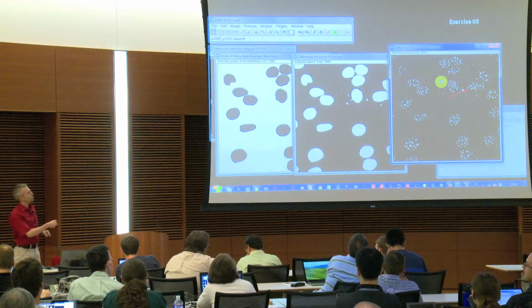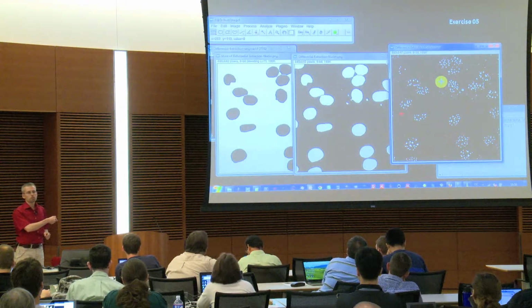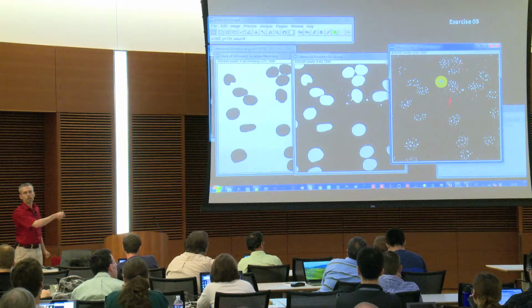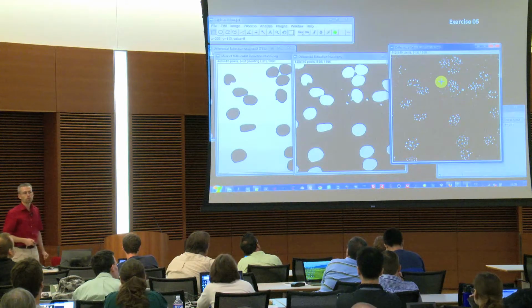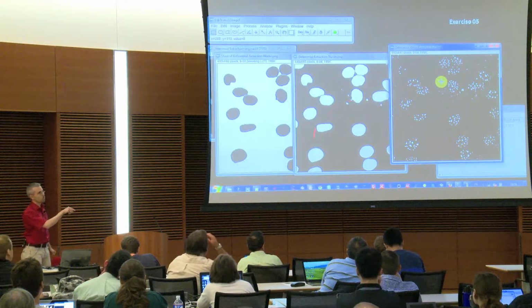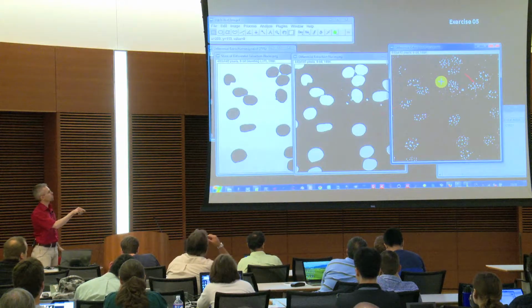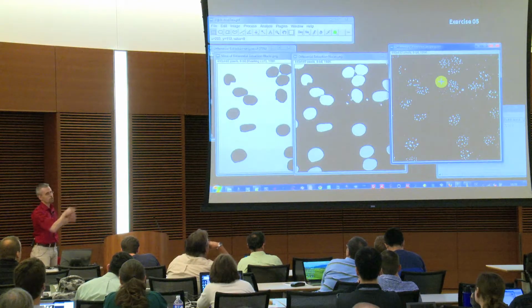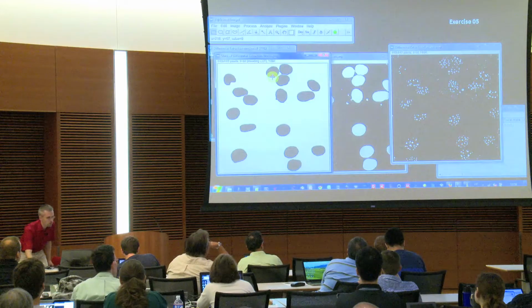We cannot simply use that image and do the same as we just did and count them, because these are still included here at the edges, so we would count way too many. So we somehow need to extract only those spots which exist in the ones we have extracted, so only our 16 ones.